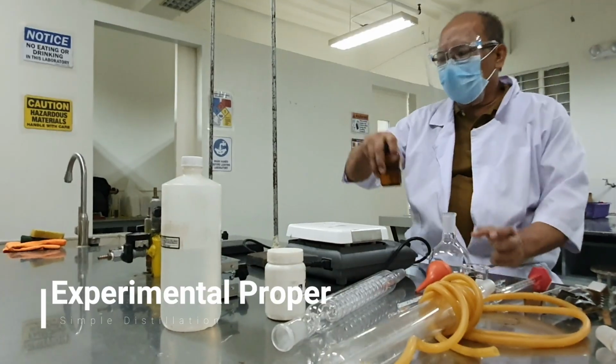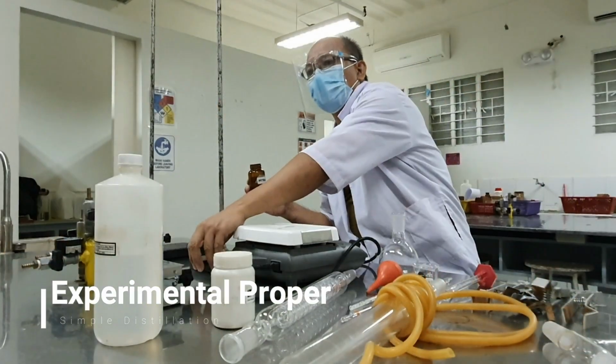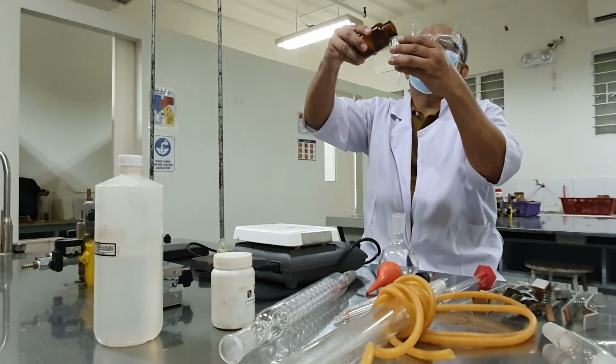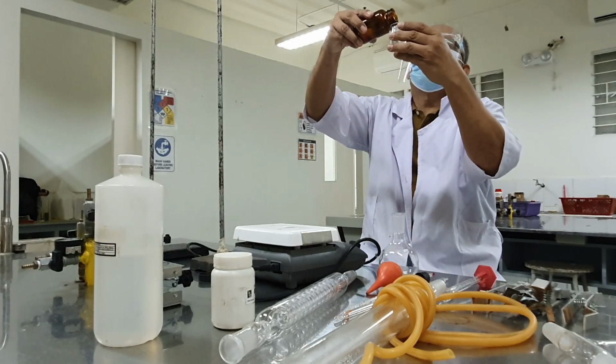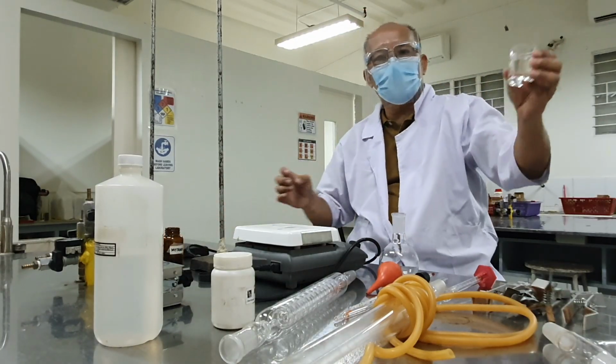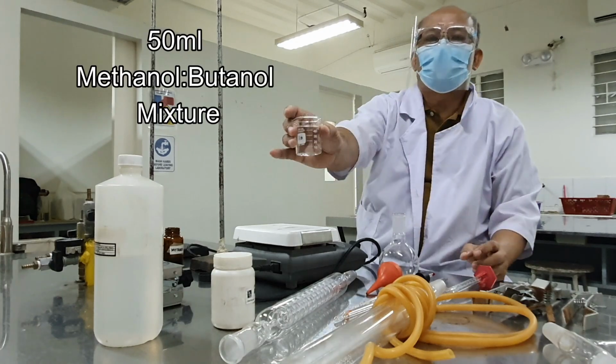We are going to add 40 to 50 ml. We'll approximate this using a beaker. So we have 50 ml here. Okay, there, it's 50 ml. Get the reading there, the 50. So here, 50 ml.